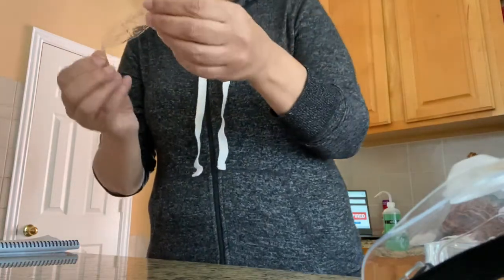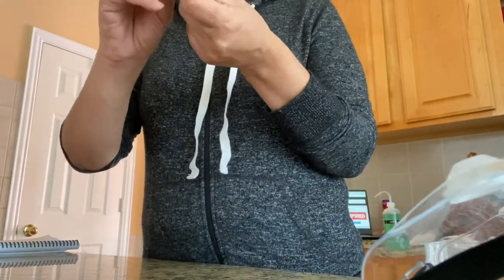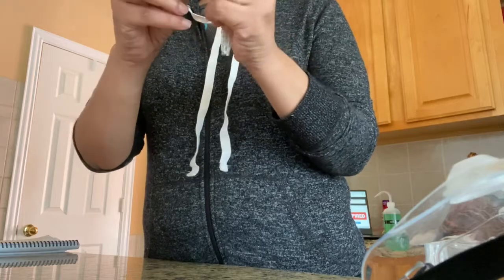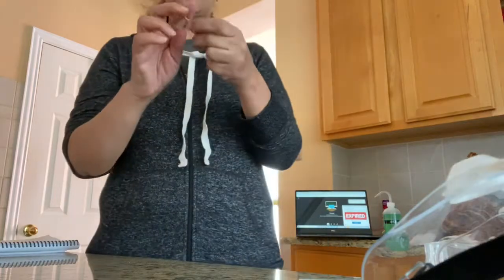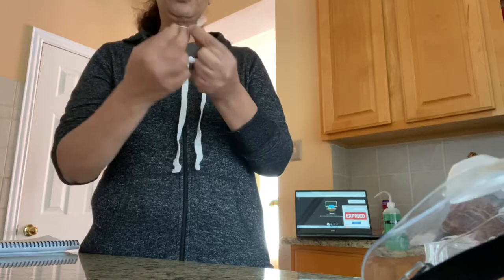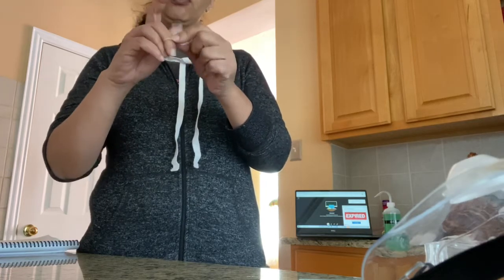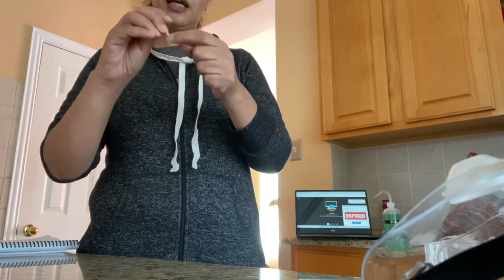Because my starch solution, I'm going to put it inside. As I said, this is an artificial selective membrane that we know doesn't let big molecules go in and out, back and forth. But it lets the water get in, but not big molecules such as the starch. And you got it, you know what we are using. We are going to put iodine in a beaker. Iodine can diffuse inside of the membrane, but the starch cannot diffuse in or out. So I'm going to put starch inside of my membrane.